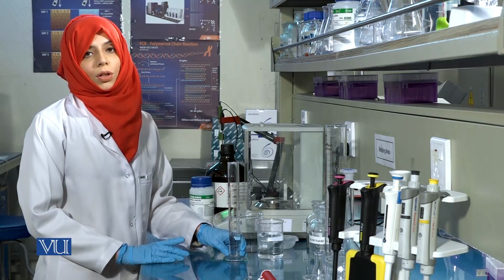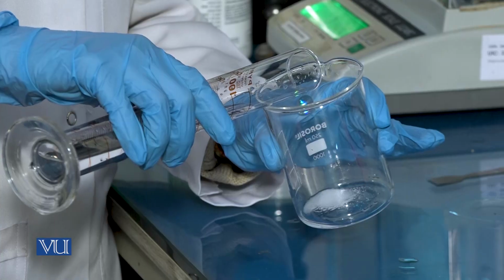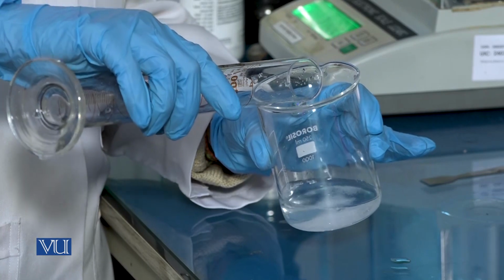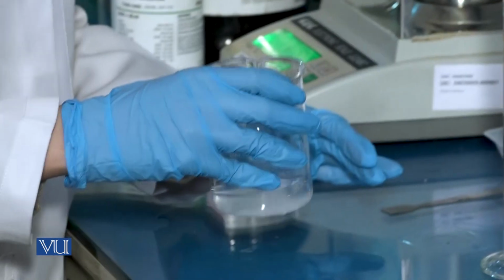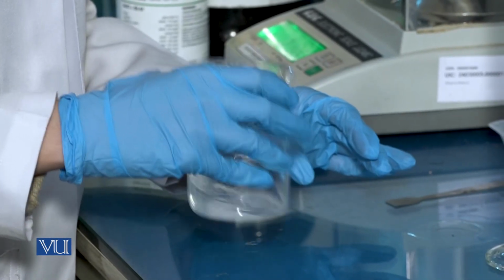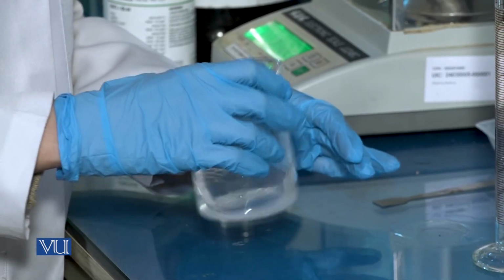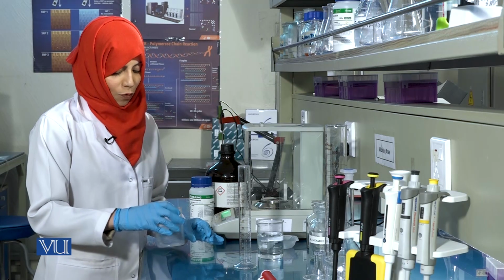Since we're making a total volume of 100 ml, we can use any volume less than 50 ml at this stage. Mix the solution to dissolve all the salt.